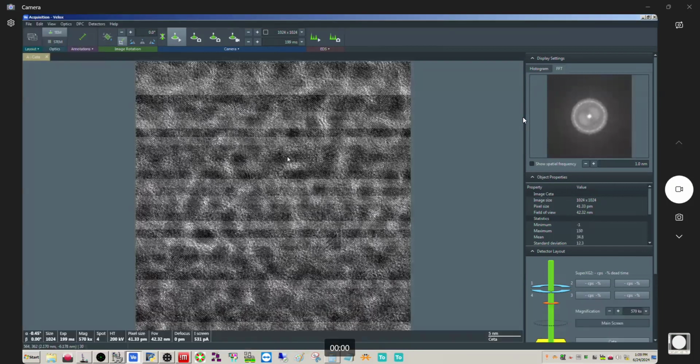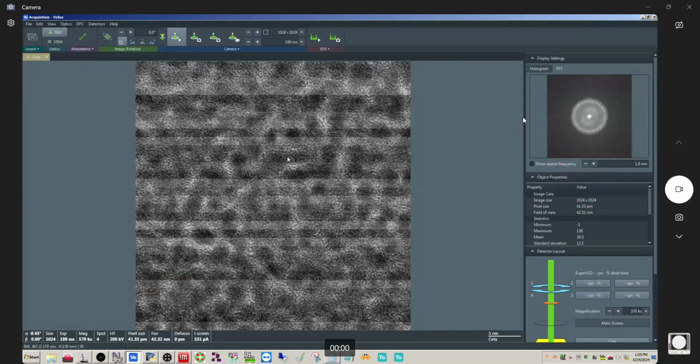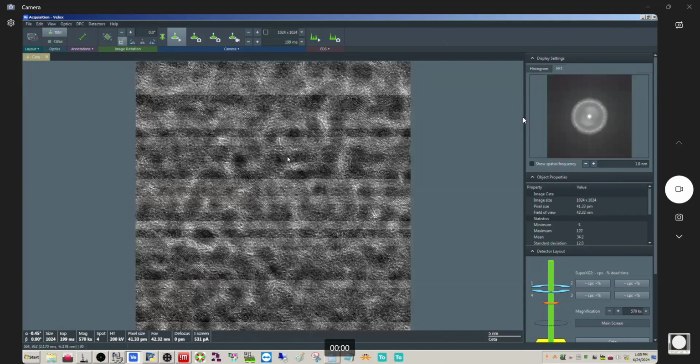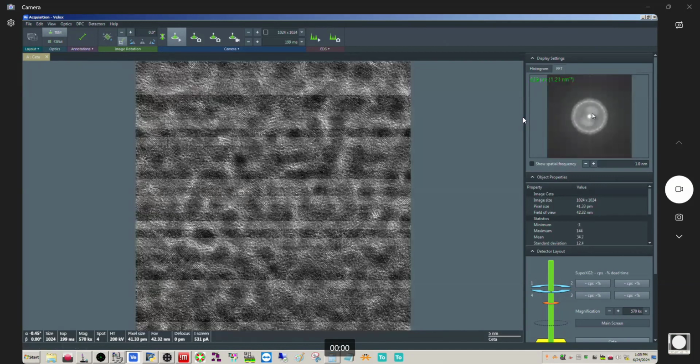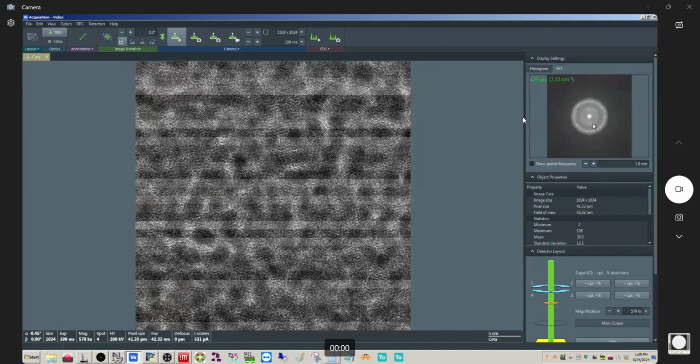And we can make the ring, the diffuse ring. So again, there's a ring in there that's from the crystalline component, okay? I'm not concerned with that. You can see it's this diffuse ring in the middle here, this dark ring. That's what I'm worried about here. And there we go. That's perfect, okay?